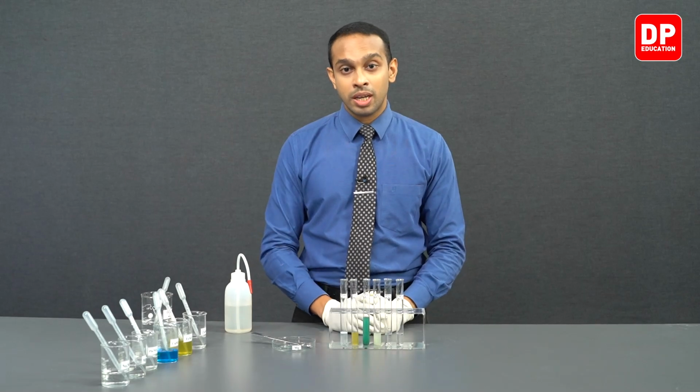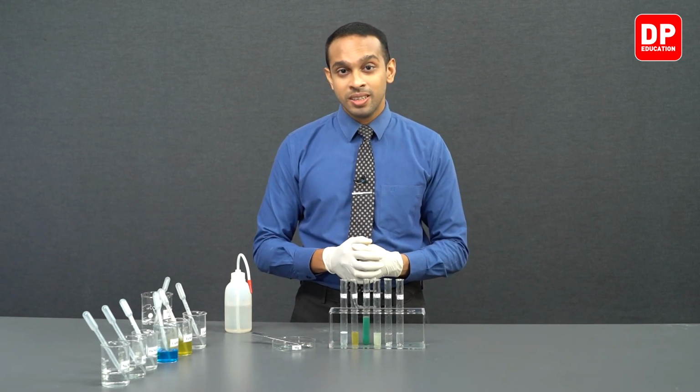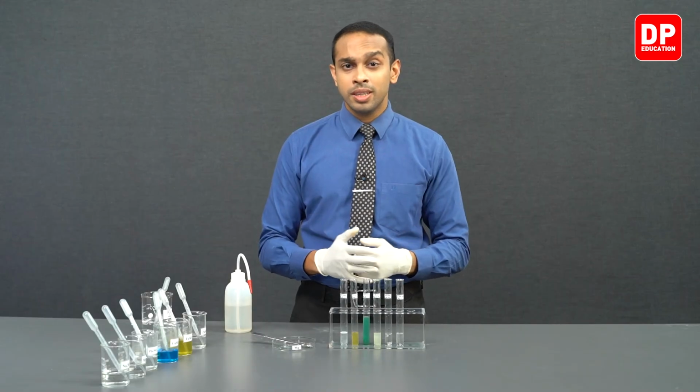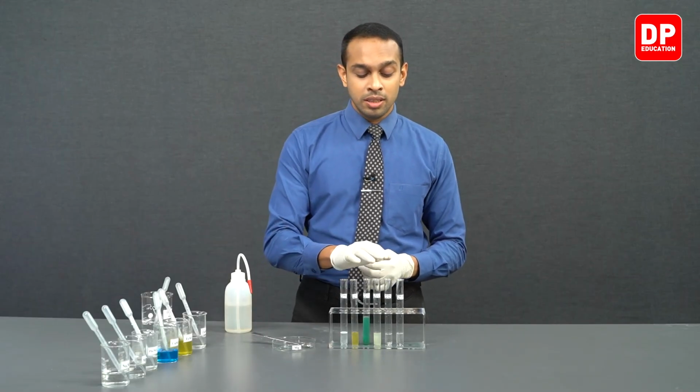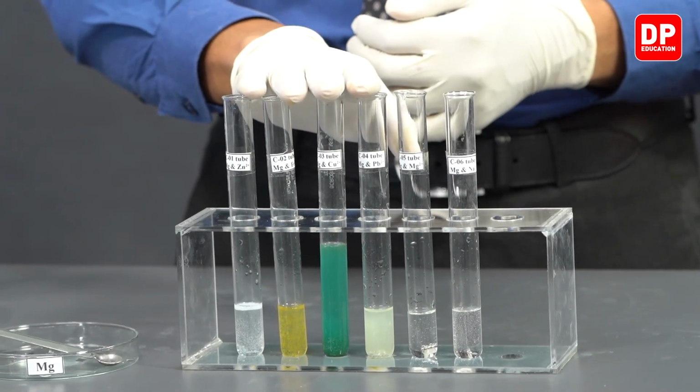But when magnesium was added to magnesium 2+ aqueous ion solution, will there be a reaction happening? Can magnesium displace its own ions? That won't necessarily happen. There is an equilibrium between magnesium and magnesium 2+ ions. However, there won't be a displacement reaction that is going to be observed like we observed in the previous instances.